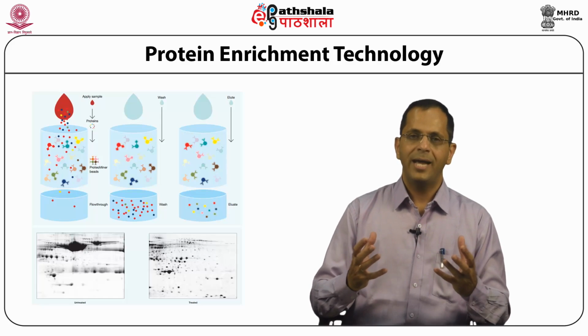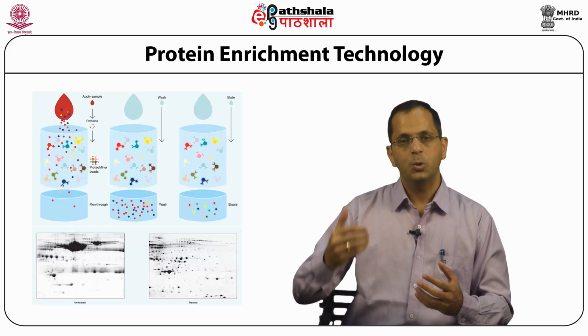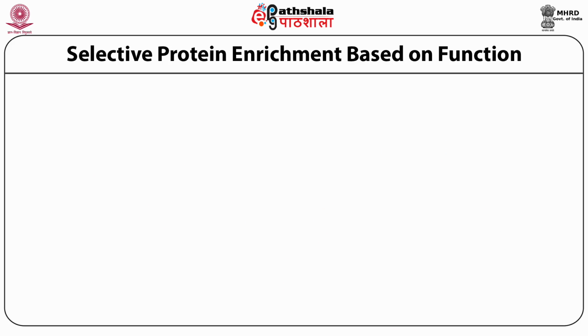Thereby, you could be having differentially expressed proteins and you could be identifying them with that much better accuracy.